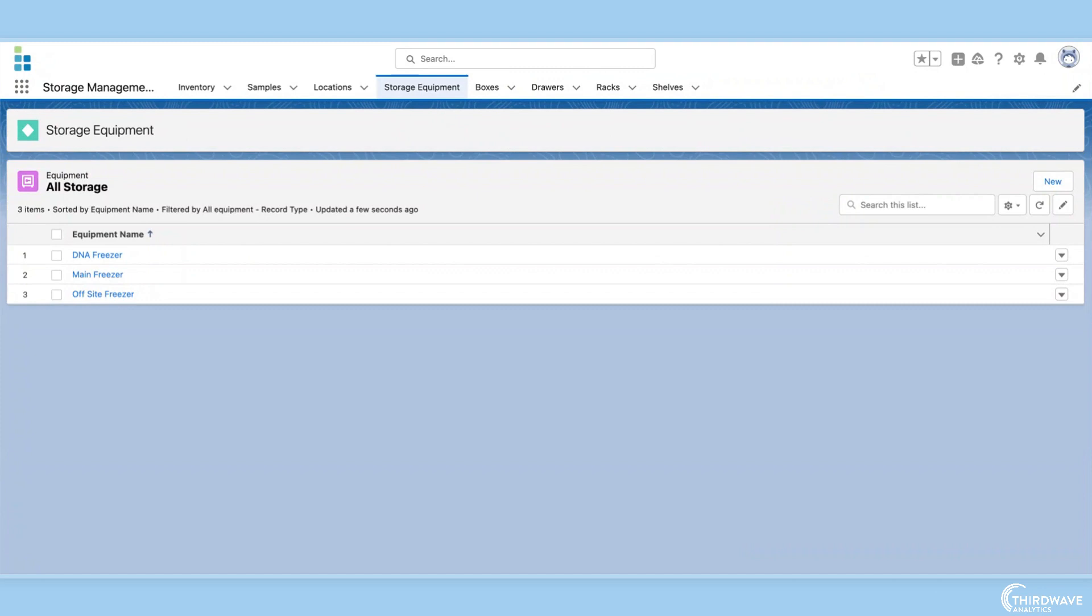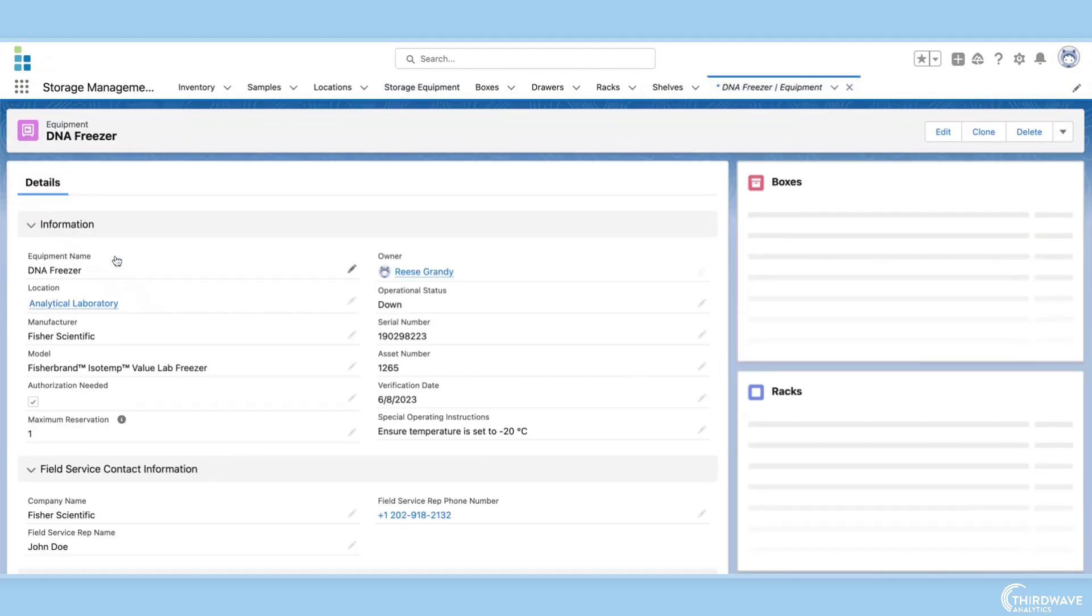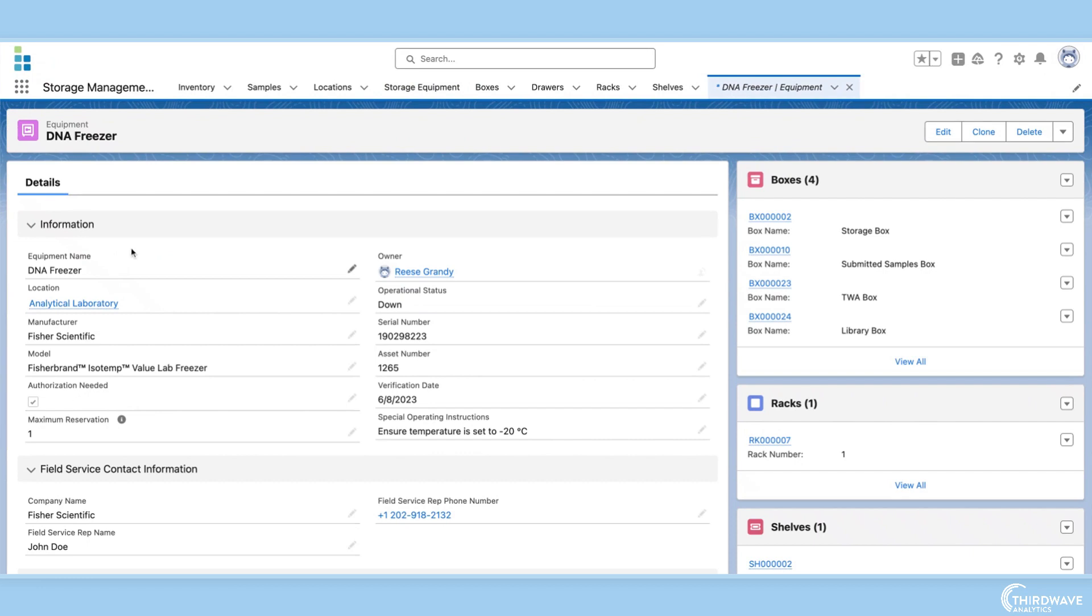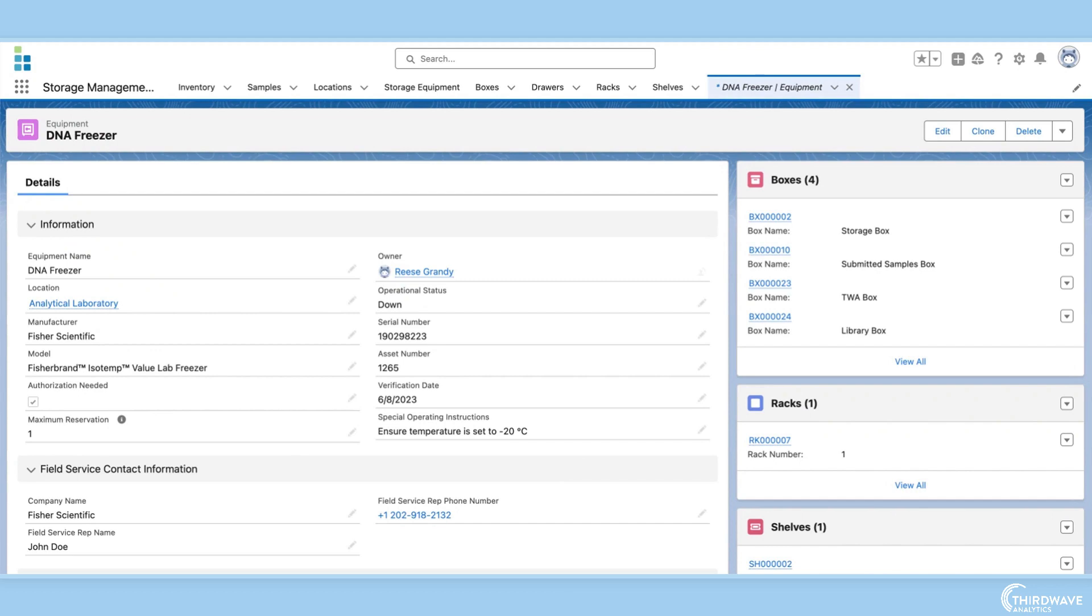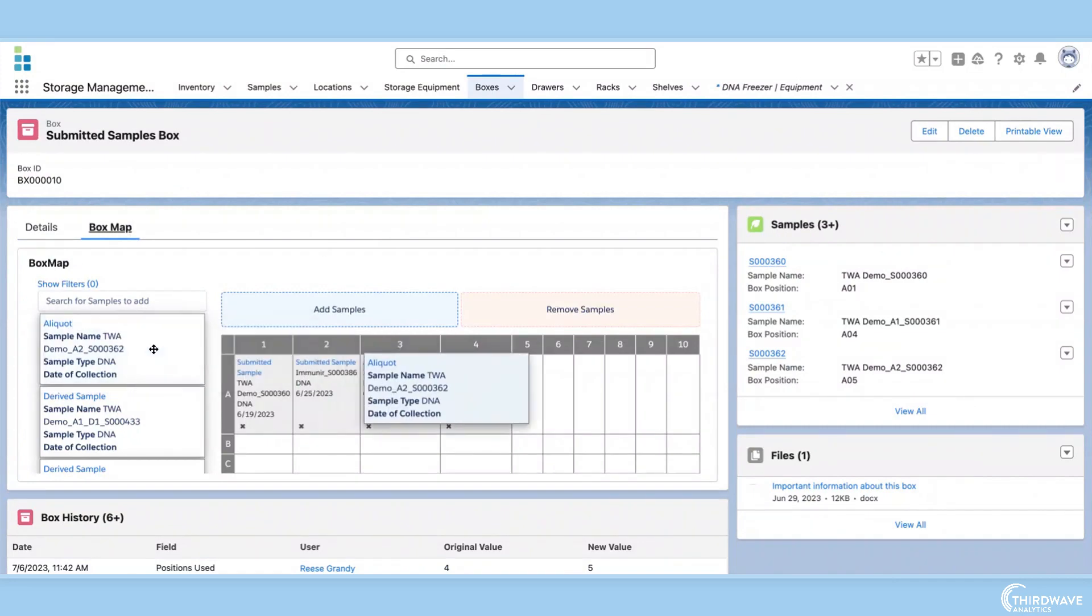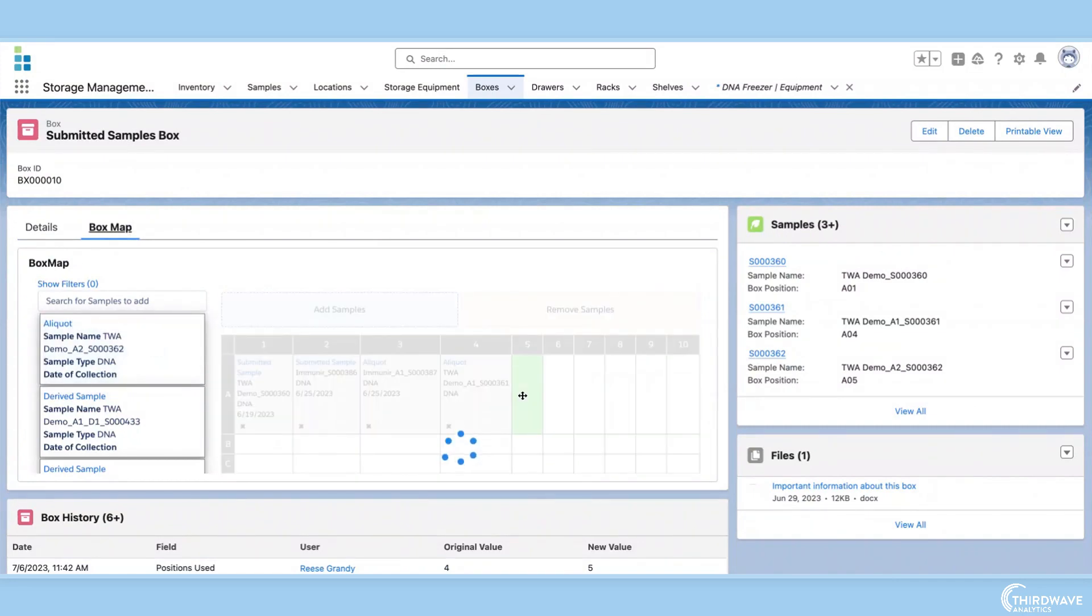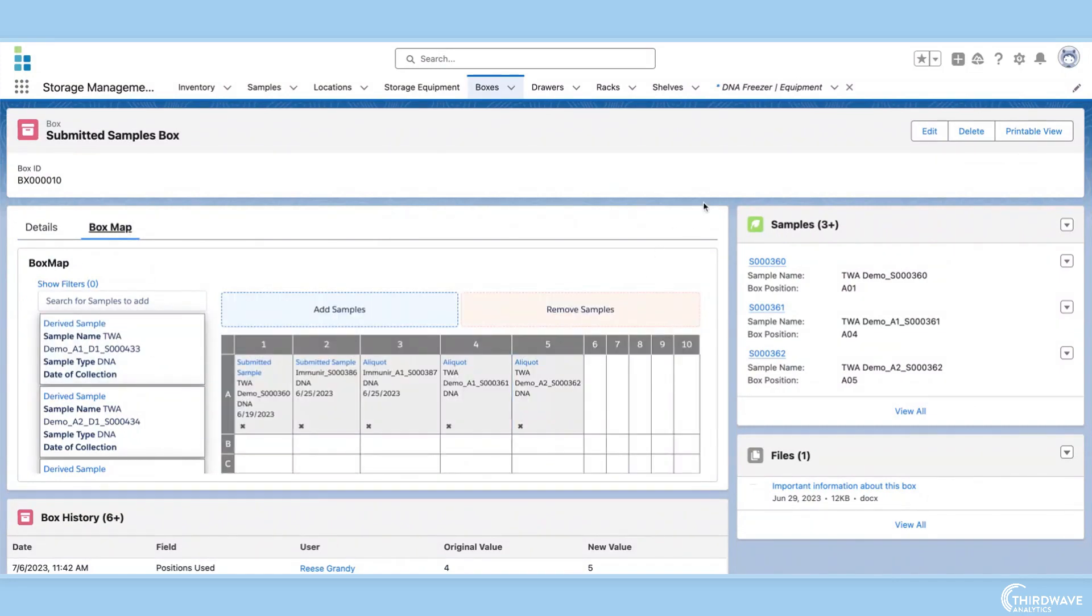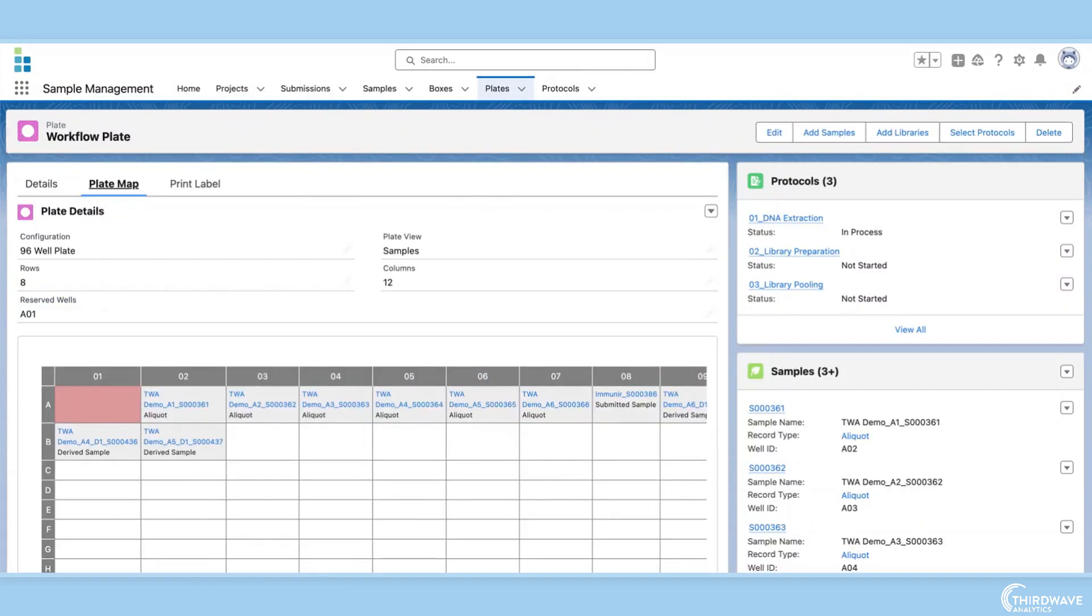The fourth feature is storage management. Labs can be huge, with multiple refrigerators, freezers, liquid nitrogen dewars, all in different rooms and floors. To easily pinpoint sample locations, Lockbox LIMS has storage management capabilities that can be configured to your exact requirements. For example, this box has been specifically configured for this lab's needs.